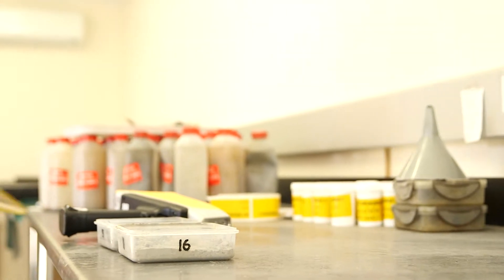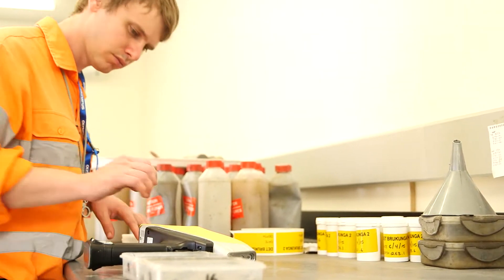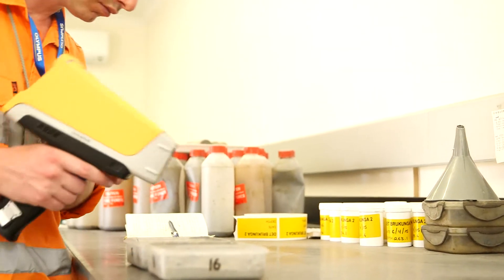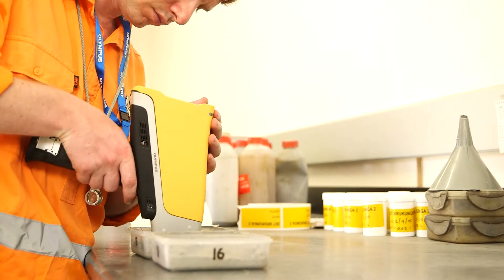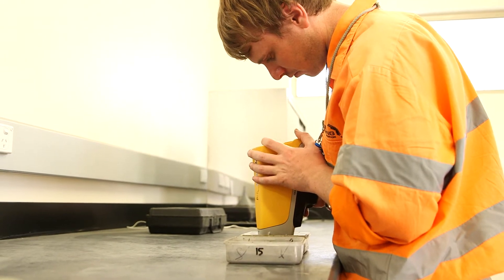The other technique that is often used is collecting the samples and taking all of them back to a central location, having the instruments set up at a field camp where they run all the samples very systematically.